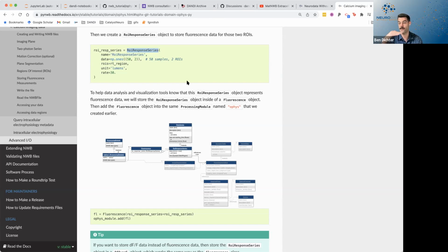And sometimes the planes are further apart, and you're really doing planar segmentation on one plane and then planar segmentation on another. In that case, it might make more sense to have 2 plane segmentation tables, one for each plane of the image. It depends on how you're thinking about it.